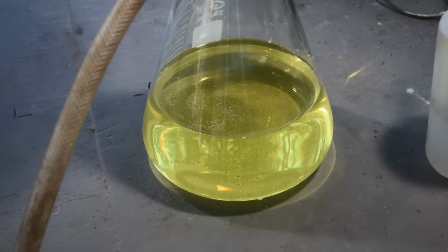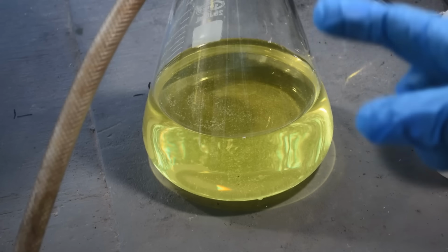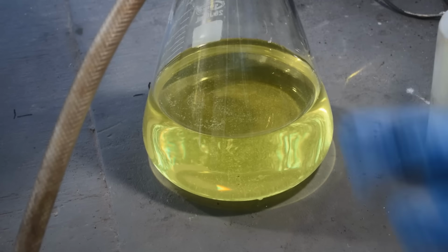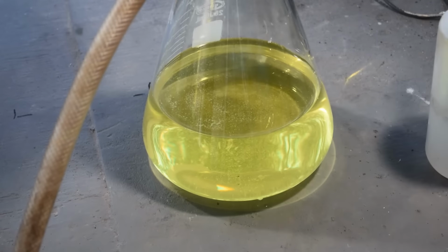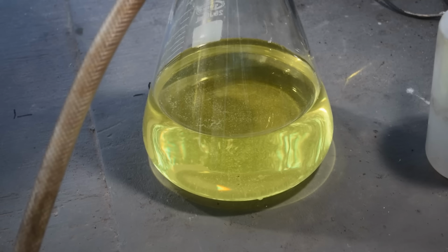But I think what I'm going to do instead is put this in the fume hood and let it sit overnight. And it's going to get quite cold tonight for Florida. You know, for Florida, it's going to get cold. Maybe in the mid to upper 50s. And I'll bet as this stuff cools down, we're going to get a lot more crystals forming. And what I think I'll do is tomorrow I will refilter it and get rid of them before dropping the gold. I think that might be a very good idea. So just so we get as clean a gold as possible.